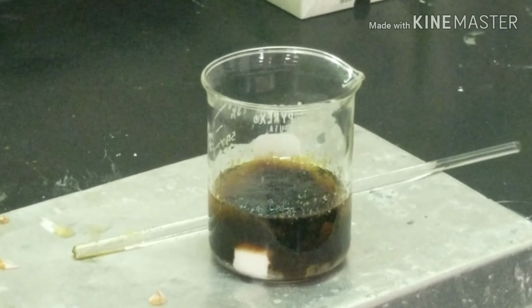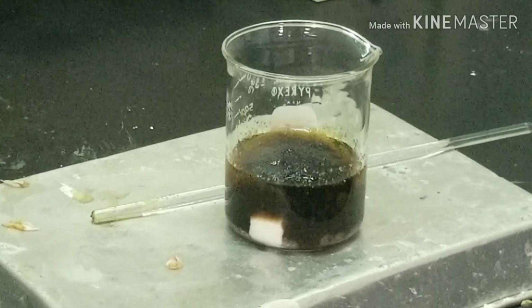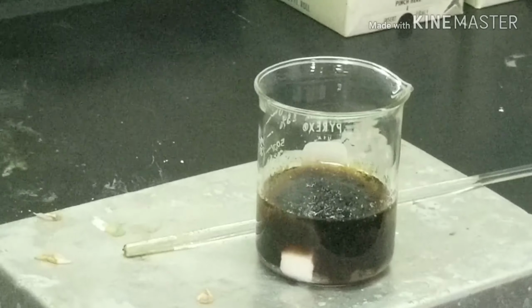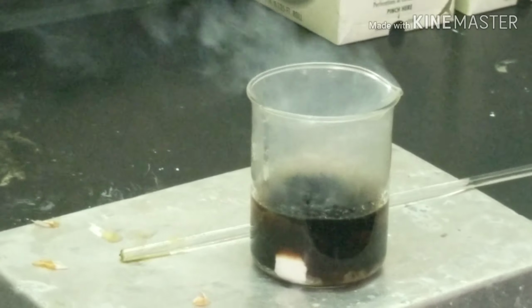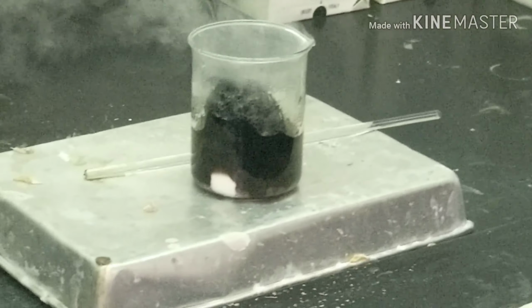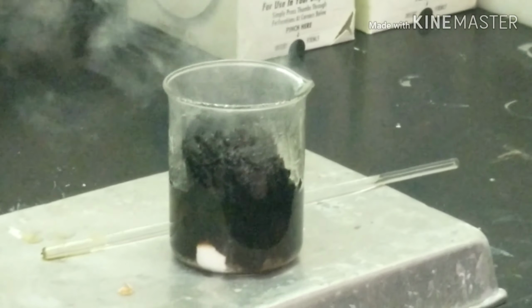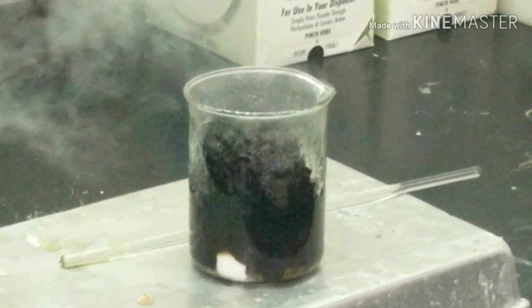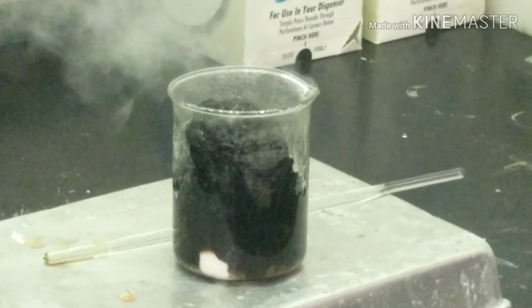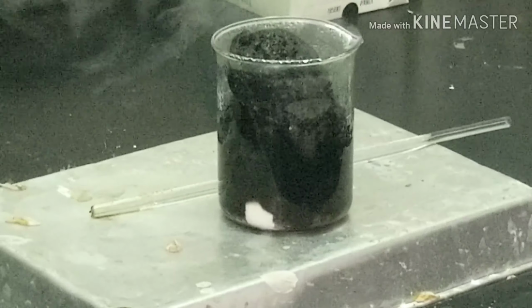The reaction will really start to take off when we start seeing water vapor appear. The reaction will be so exothermic, and there we start to go. We start seeing the water vapor. There's probably some sulfuric acid vapor as well, so we definitely have the fume hood on. What we're seeing is that carbon being pushed up by that water vapor.